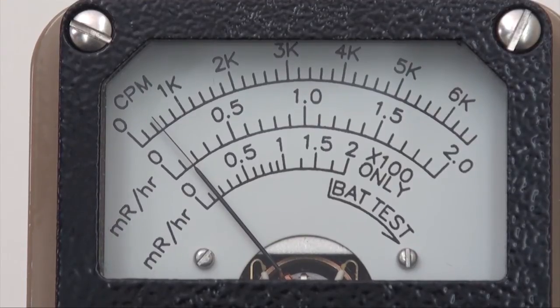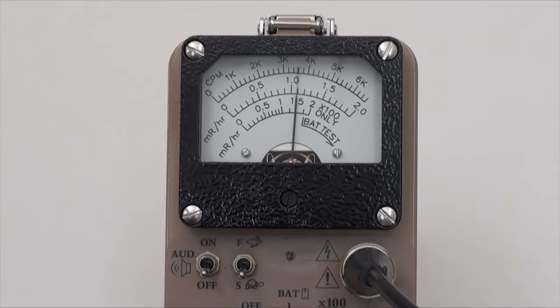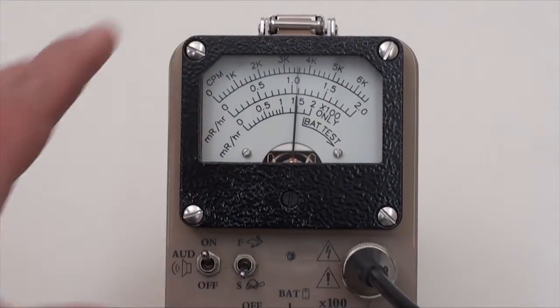Since this meter face simultaneously presents another scale for exposure using milliroentgens per hour units, the calculated exposure is 1.5 mR per hour. Other switches include an audio on-off switch.